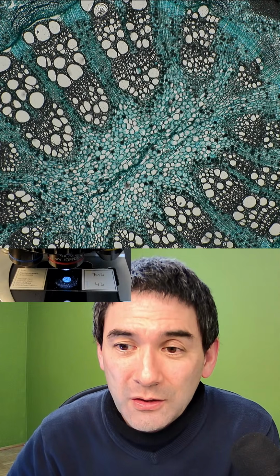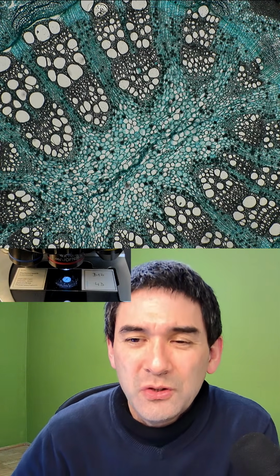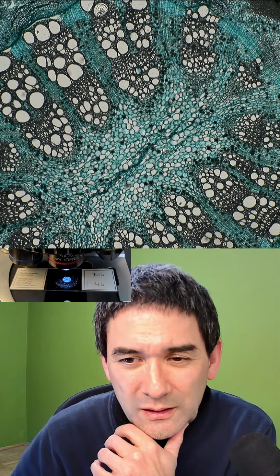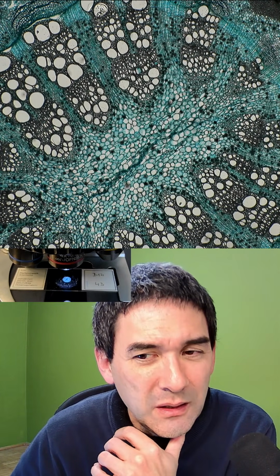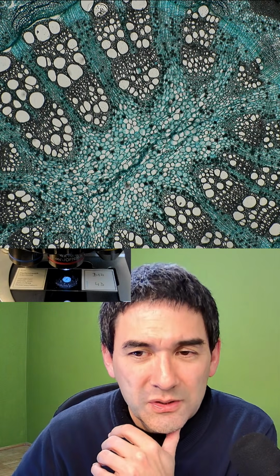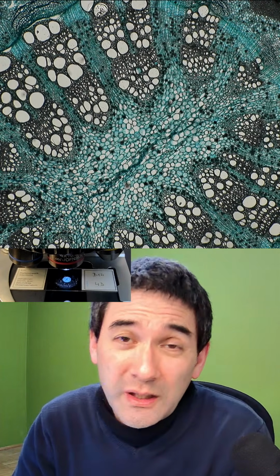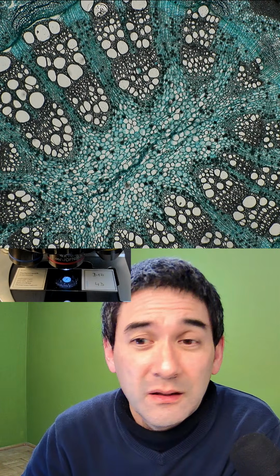Do you know anything about cleaning microscopes? I have a feeling lower end scopes like Swift, etc., need a good clean inside and out to get the best out of them, even if new. Honestly, I wouldn't clean them unless really necessary, and dust will always accumulate. My general advice is don't clean unless really necessary.